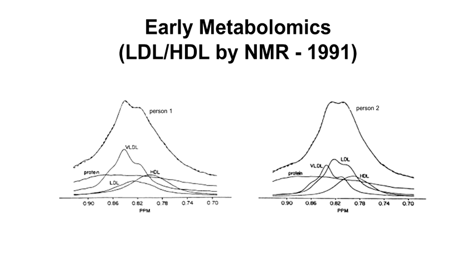So you can even measure many other sub-components of lipoproteins. And in fact, it's up to about 15 or 16 that can be routinely measured. So this technique has become highly used in the US. It's FDA approved. 1.5 million samples are processed every year by NMR. It's much faster than most other techniques and much more accurate.